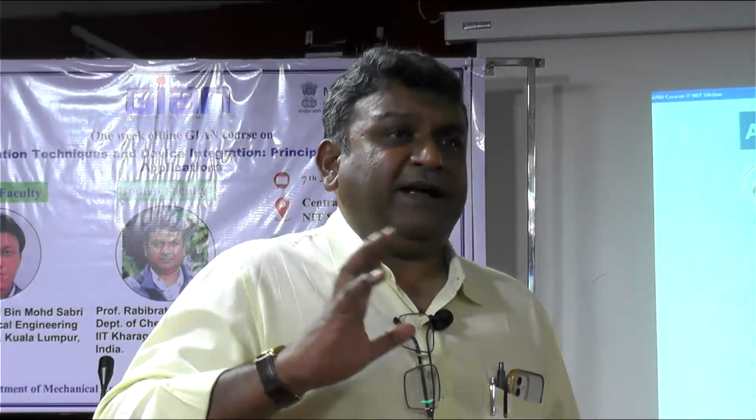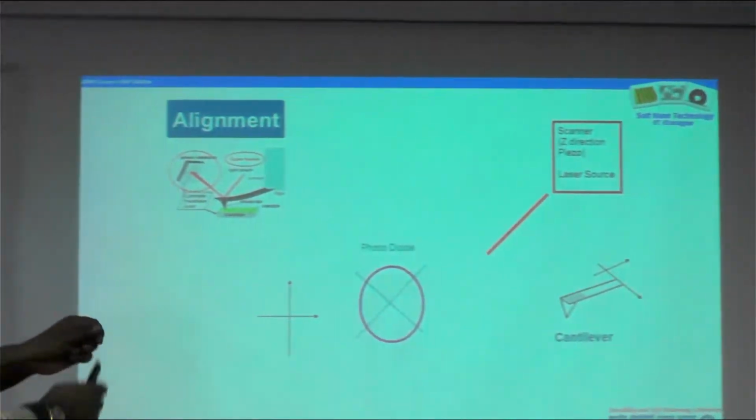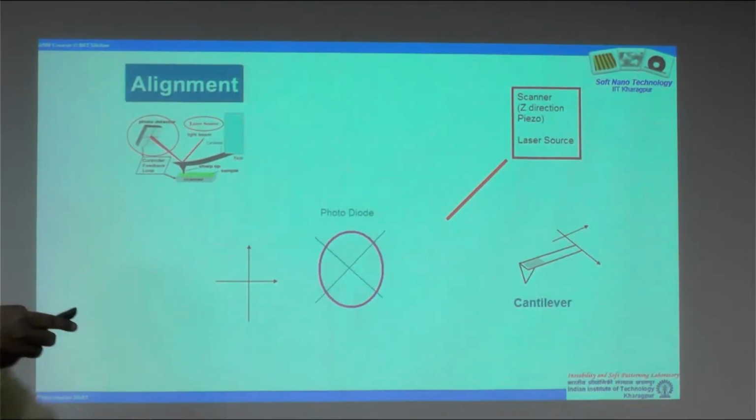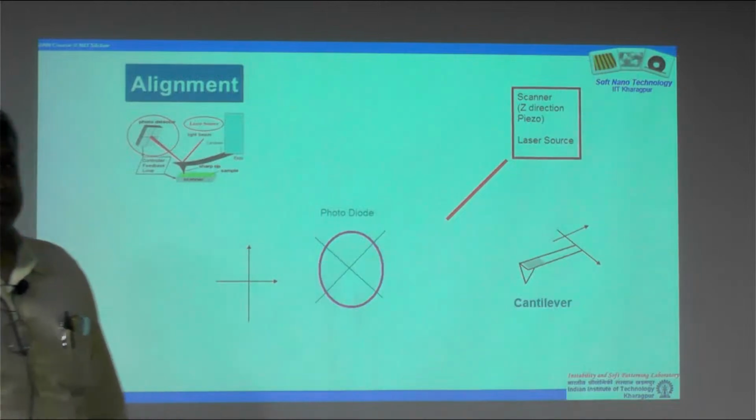We prefer to do it manually because that gives you a very good feel about how good your microscope is going to work. So basically, you have two sets of orthogonal vernier caliper screws, nothing else. So you can rotate these two screws to make movement, your simple dynamics lesson, right?